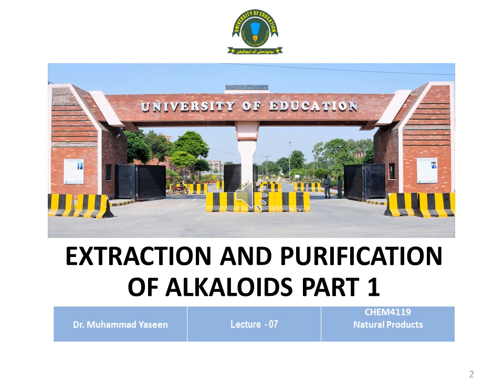My dear student, I am Dr. Muhammad Yasin. Today it is our first lecture on the extraction and purification of alkaloids. In this lecture we will mainly discuss the different extraction methodologies that people are using for the extraction or the isolation of alkaloids from the plant material. This course belongs to the natural product course code 4119. Let's move towards our topic of extraction and purification of alkaloids. Remember, it is the first lecture on the extraction and purification of alkaloids.